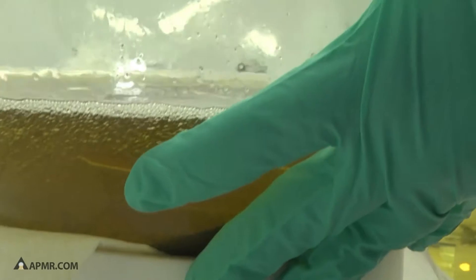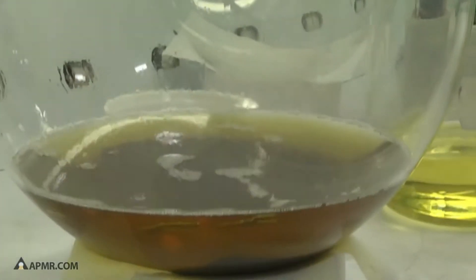Placing our fume evacuation hose on top of the flask so that any fumes given off by this reaction will be contained and processed through our chemical fume scrubber.